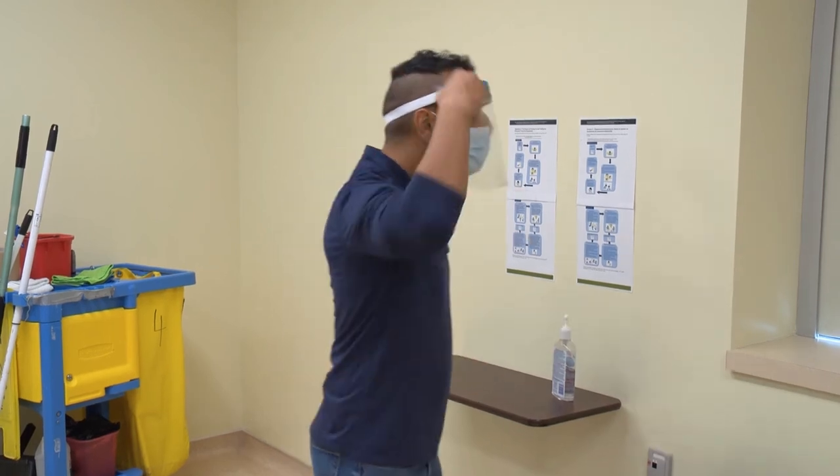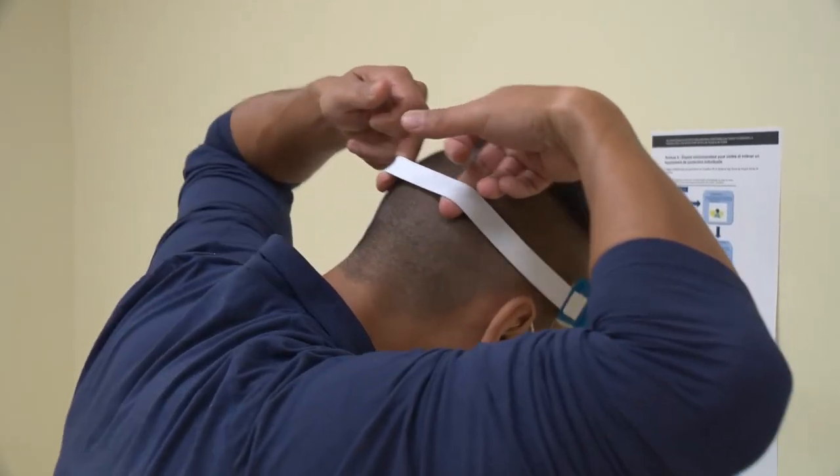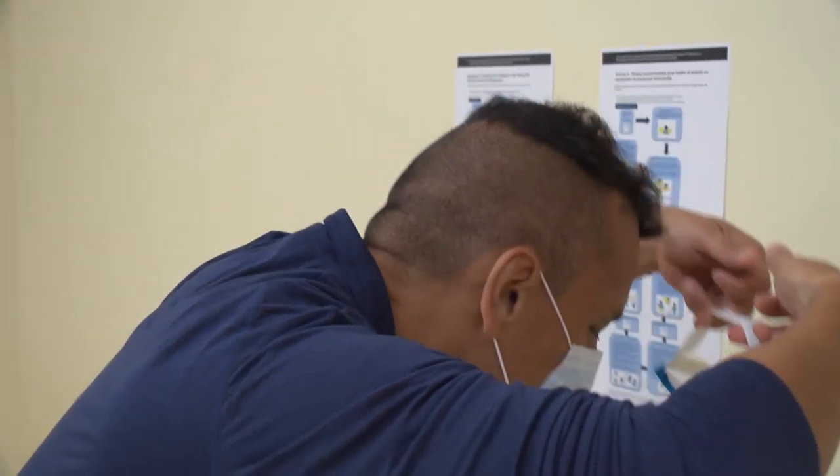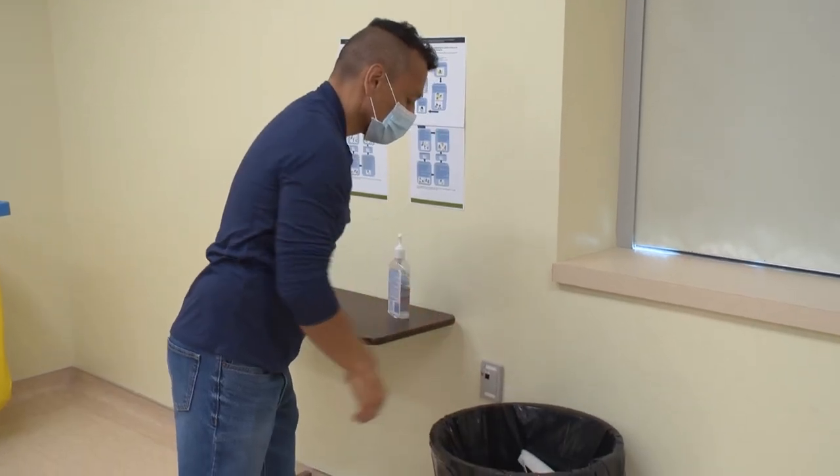Now, bending at the waist, grab the strap of your face shield at the back of your head. Lift the back strap slightly. Lean forward over a waste container and allow the face shield to fall into it.